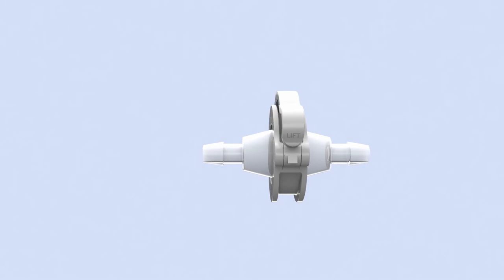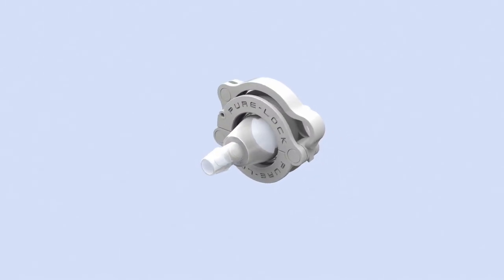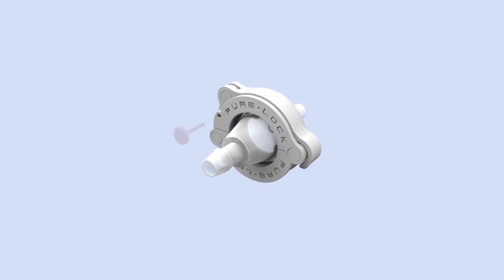PureLock cannot be over-tightened by the installer as there are no screw threads or locking nuts. An optional sacrificial security pin provides evidence of any tampering.